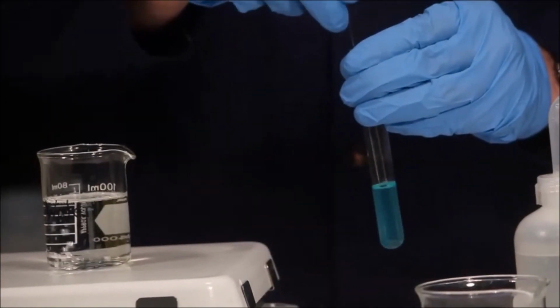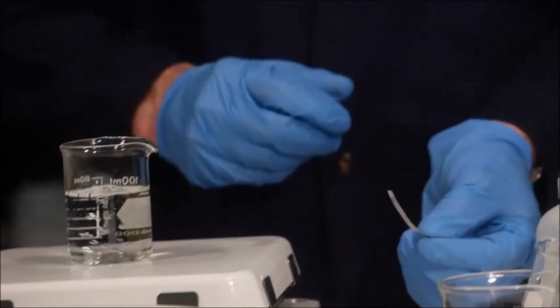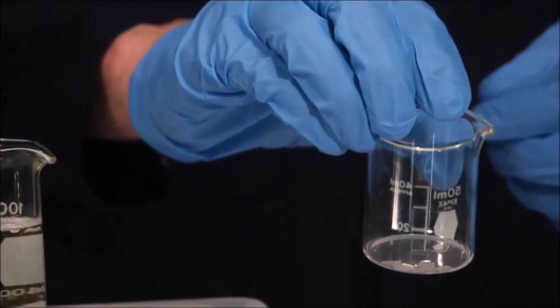After 2 or 3 minutes of stirring, the copper(II) sulfate will dissolve completely. Next, it's time to get the magnesium ready to do the reaction. You're going to need an approximately 4.5 centimeter piece of magnesium to perform the reaction. You want to simply cut your piece of magnesium into 10 equal pieces.